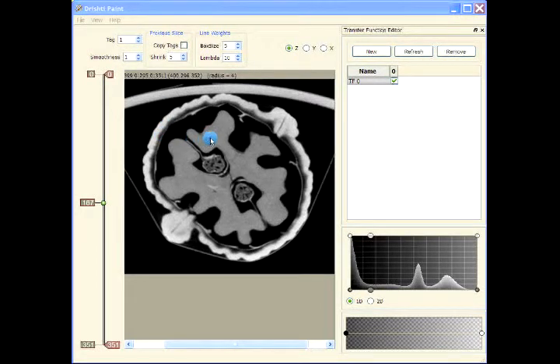We will continue with this walnut segmentation. Now let us see the effects of this box size and lambda on the segmentation process. These are the defaults, 5 and 10. So I have selected the region to be tagged, defining it as the object region, and when I press T, this is the region that is being tagged with this current setting.